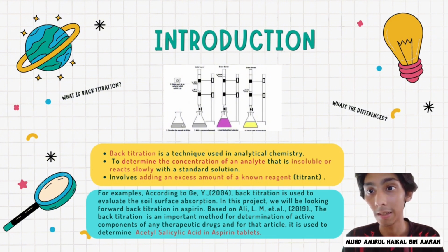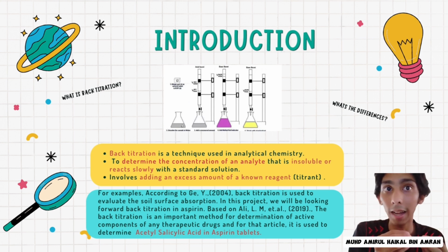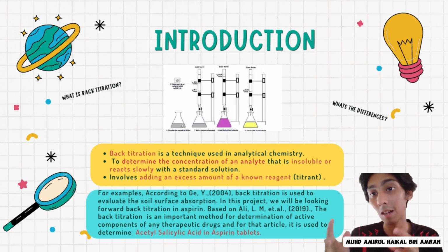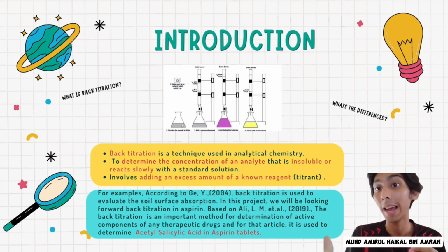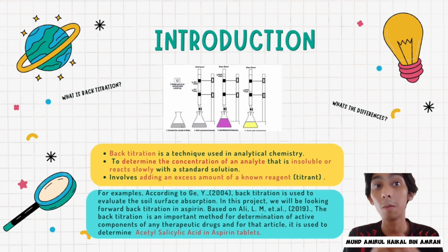So what is back titration? Back titration is a technique used in chemistry to determine the concentration of an analyte that reacts slowly with a standard solution. Usually, back titration involves adding a solution in excess amount to react with a compound in the sample. According to an article, GY 2004, back titration is used to evaluate soil surface absorption. But in this project, we will look at back titration in aspirin. So let's go.